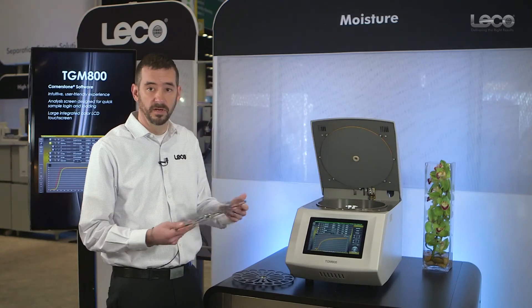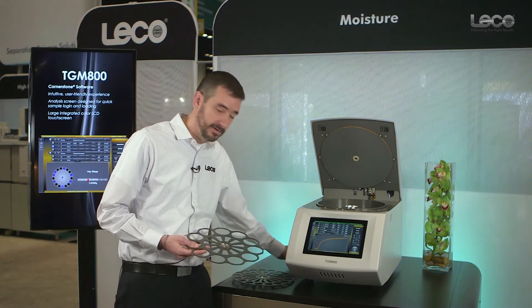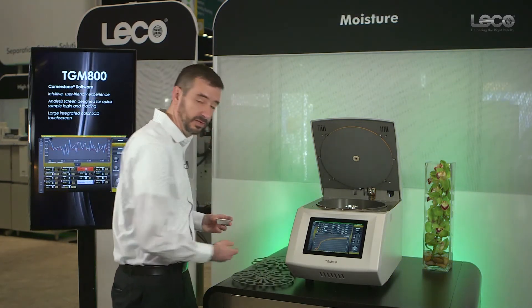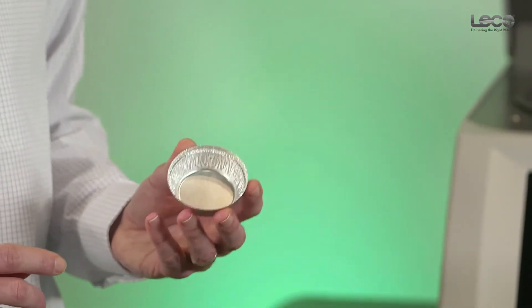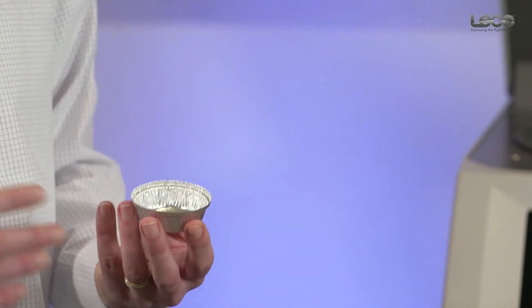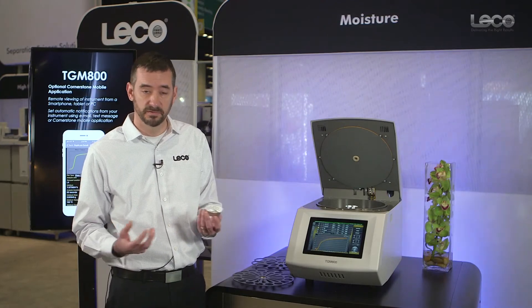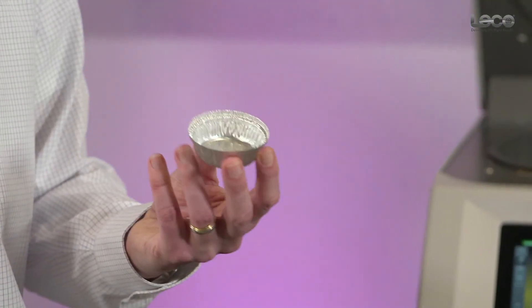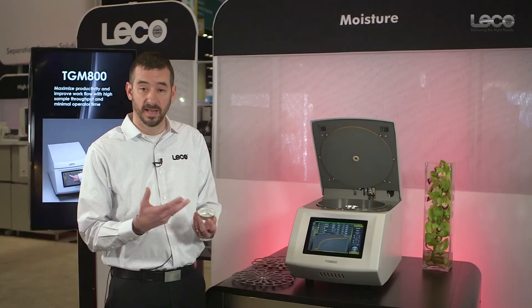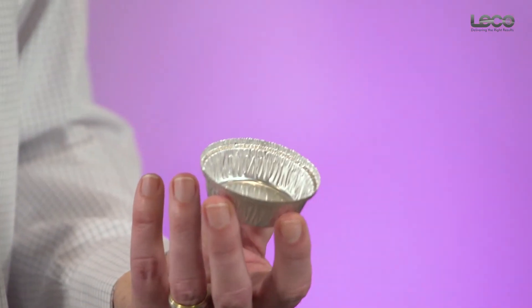Our next carousel supports a sample batch capacity of 10 samples. It utilizes the same aluminum foil crucible composition, but now 2.4 inches in diameter, supporting three to ten grams of sample. The larger crucible mimics the manual loss-on-drying technique and allows larger sample sizes for matrices that may have heterogeneity or homogeneity issues.